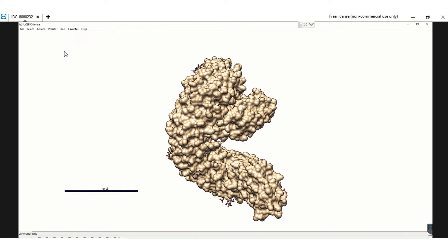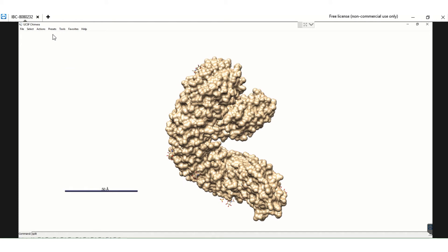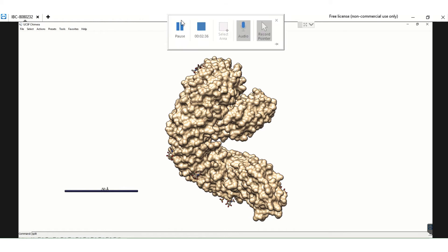For making it publication quality, go to the Presets option. Under Presets there are multiple options: Publication 1, Publication 2, and so on. If you choose Publication 3, you do not get soft edges that mark the outline. I choose Publication 1 because I want an outline around the structure. This gives you the protein structure with the scale bar, ready to be put in any journal or used for further analysis.